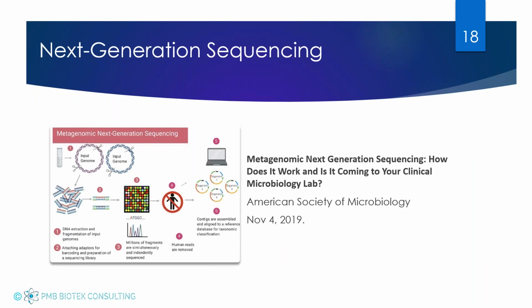And then lastly, ultimately, I think next generation sequencing will be the technique that every micro lab uses within a decade. We're not there yet from a cost standpoint, because the throughput to run the bioinformatics portion of this takes 6 to 8 hours after molecular processing. So you're looking at adding an extra day.